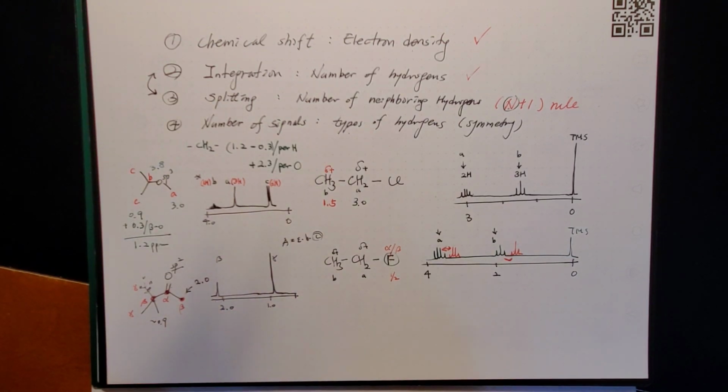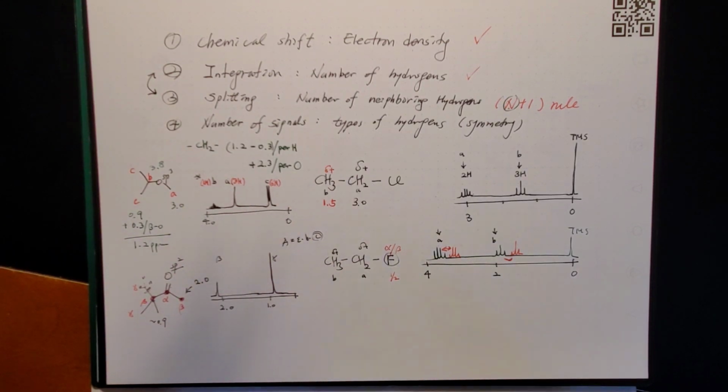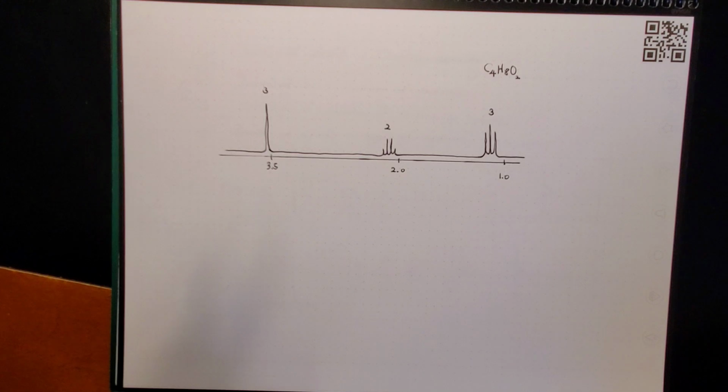And singlet. So simple. With so many hydrogens, you have such a simple HNMR. Okay, you got less hydrogen but much more complex with this other example. Look at this example. If they give you IR data, this will be a lot easier question. But let's practice without IR.